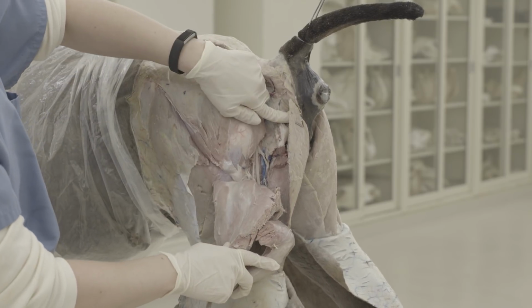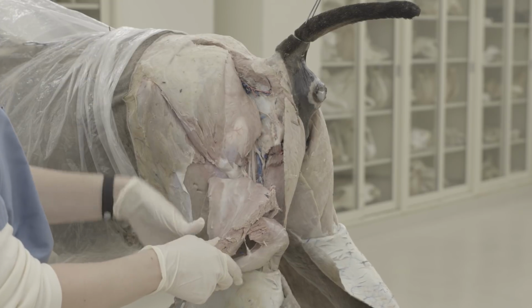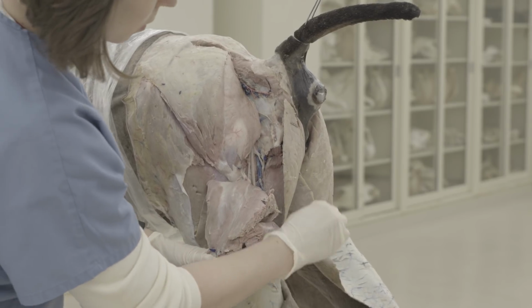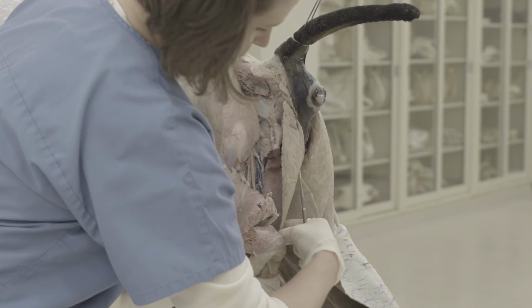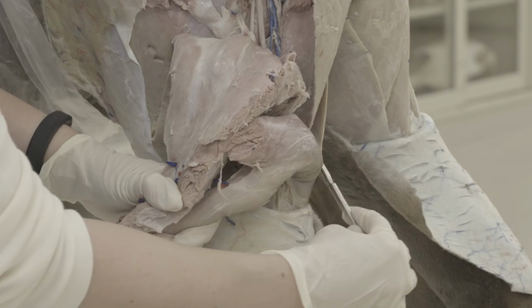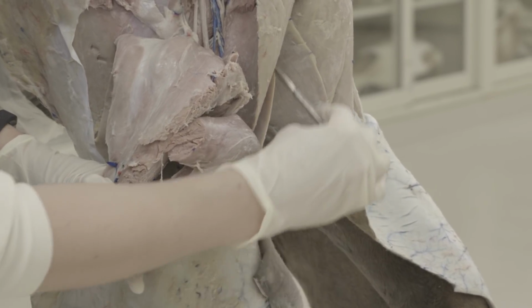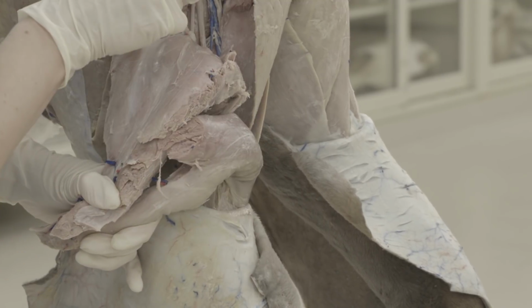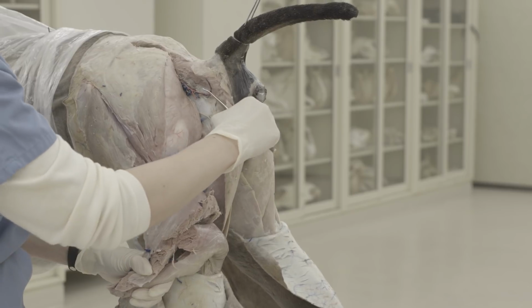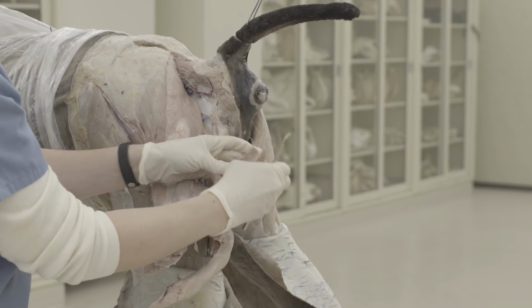So then we do a similar thing with the semimembranosus muscle here. So you're going to identify the borders of that if possible and see where the gracilis is versus the semimembranosus. So here, I'll kind of elevate the gracilis off of that. So gracilis is on the medial aspect, and we'll get to that muscle later, but you want to pull that off away from the semimembranosus before you cut it. So semimembranosus you can also cut proximally and then reflect distally, and this is a pretty thick muscle also.